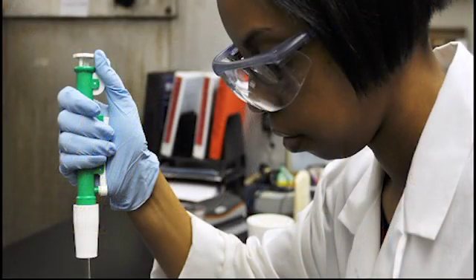Rule number 15 also states that eye protection may be used at the discretion of the lab instructor. Although not a normal requirement, a special situation might arise which could warrant safety glasses. Your lab instructor will inform you if and when this arises.